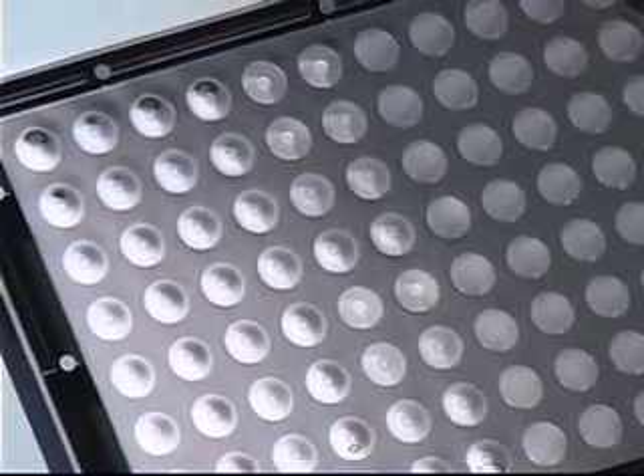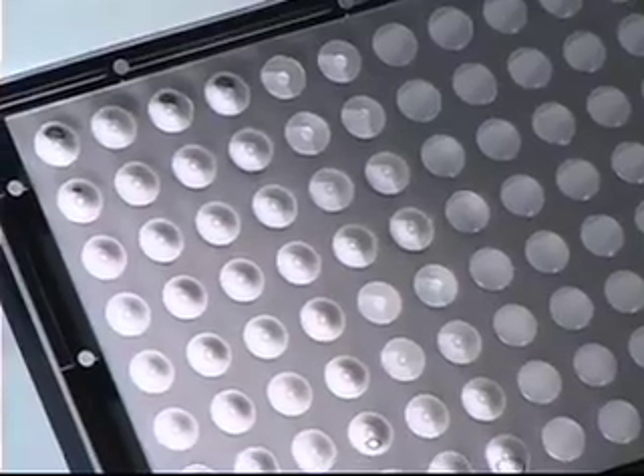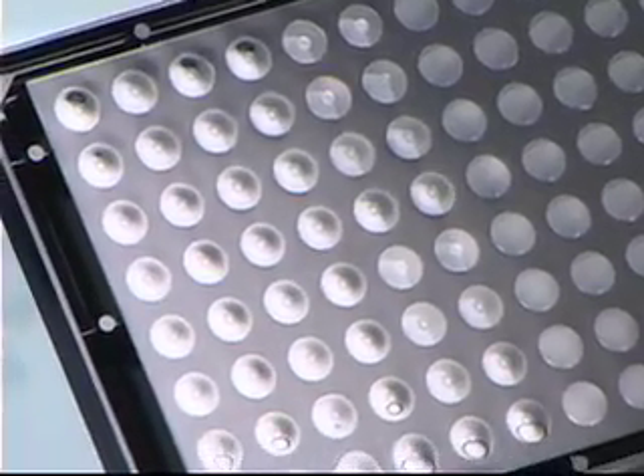Migration can be detected via microscopic analysis, digital imaging, or with a fluorescent plate reader.